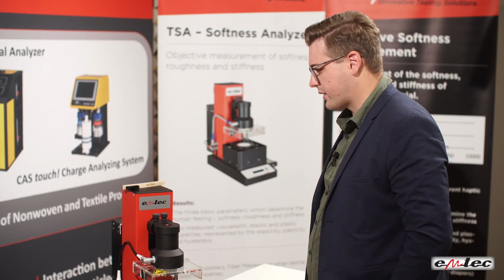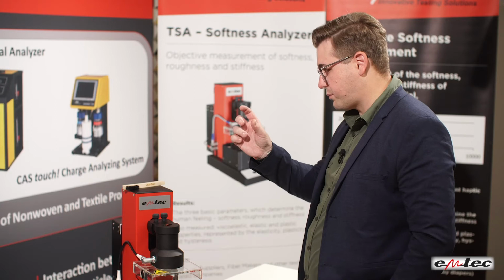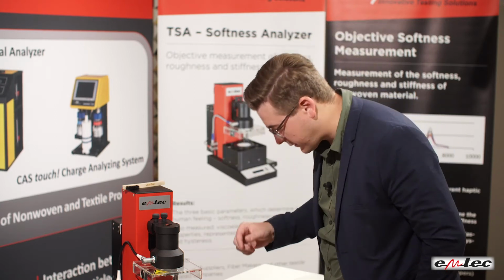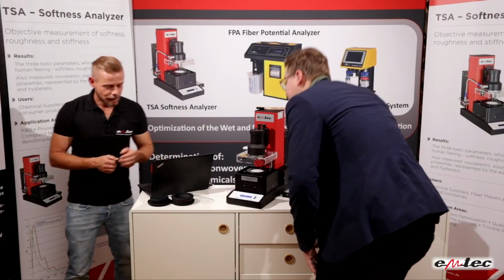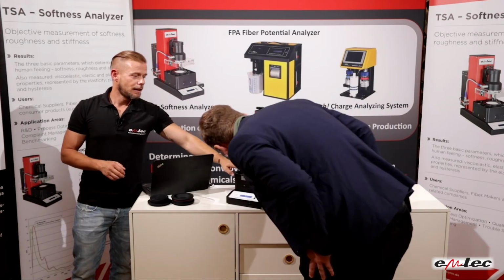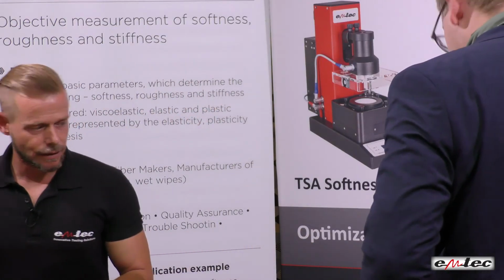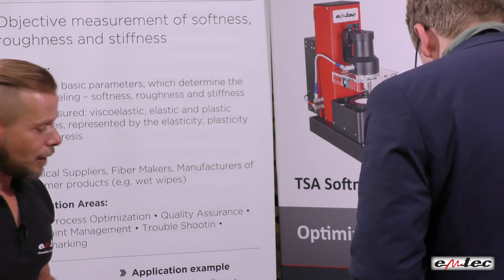Okay, our company also produces a little bit thicker material, and one of our products is also quite narrow. I'm not sure if I can fix it in here. Well, you're right. Very narrow material and also very thick material cannot be fixed in here. If you would fix too thick material in here, you could hurt the instrument, and narrow material just wouldn't hold.